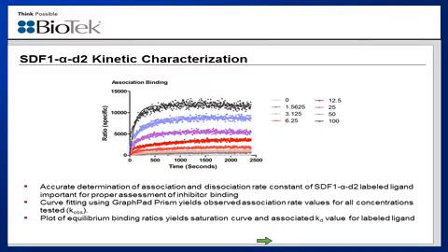Therefore, an associative binding experiment was first performed using the acceptor fluor labeled ligand that I just talked about previously. Then by plotting the HTRF ratios, those values over time, for each of the ligand concentrations tested, which you see with all the different curves that have been plotted here, the observed binding values, or the K-obs, can then be generated.